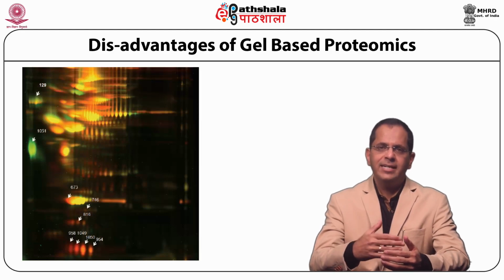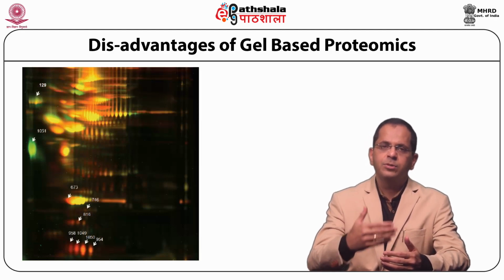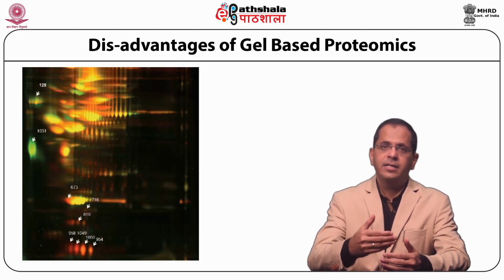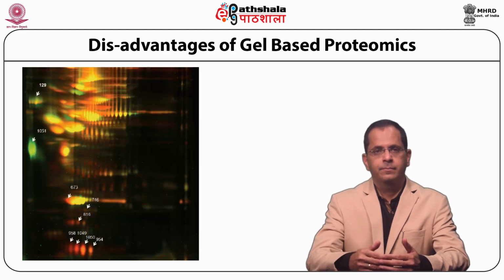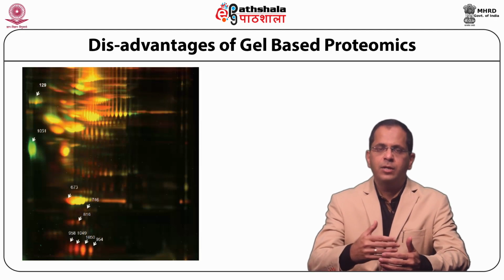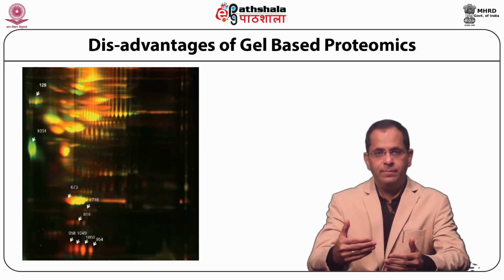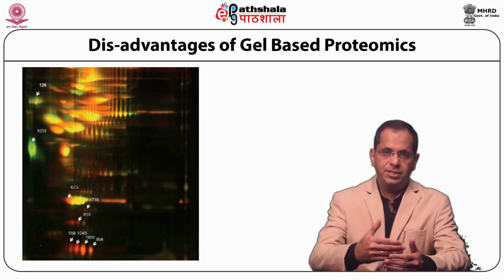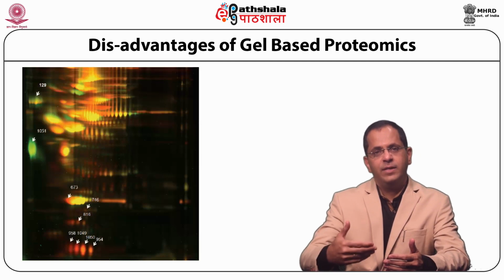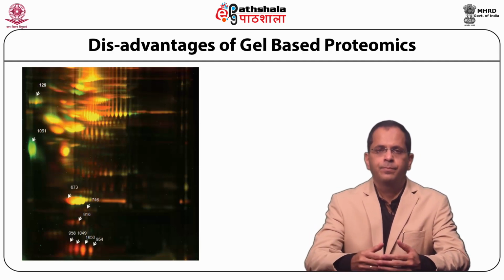The proteome is the entire set of proteins produced by an organism or a particular tissue in the human body at a particular point of time. Proteomic profiling is an experimental platform to map all the proteins expressed in a given phenotype, and differential expression compares the protein profile in two or more phenotypic states.